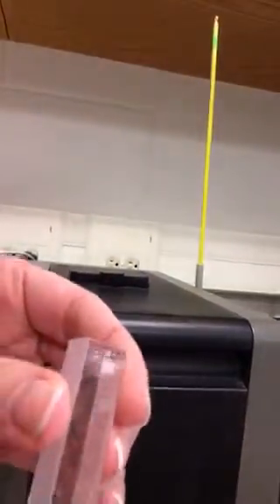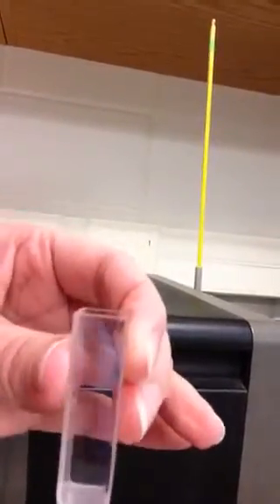Before we use the cuvette, we have to chem wipe it off. Let me do that, so that we don't have smudgies all over the sides of the glass. And you can see I'm holding it, there's a frosted side and a transparent side. I'm holding it by the frosted side.